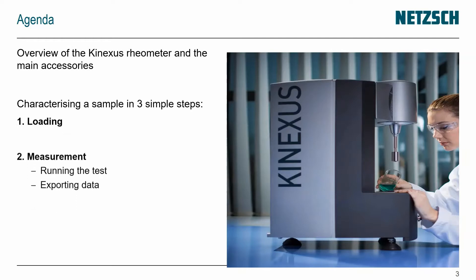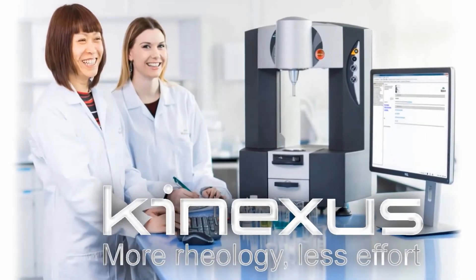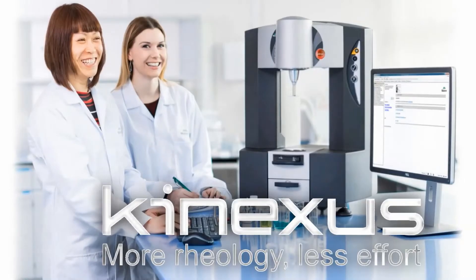Those three steps are: loading, running the measurement, exporting the data, and then unloading and saving the results. The key thing to remember is the Conexus is designed to give you more rheology with less effort.